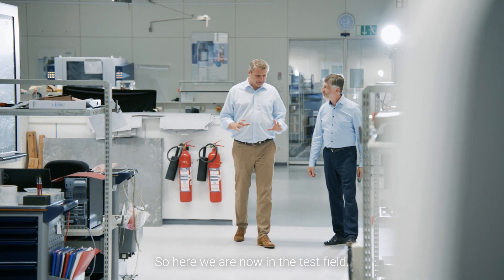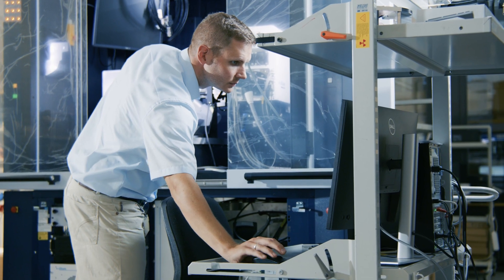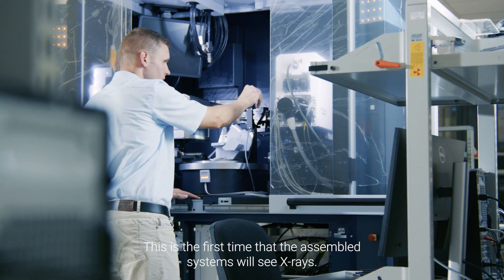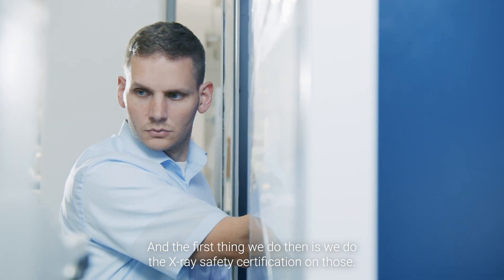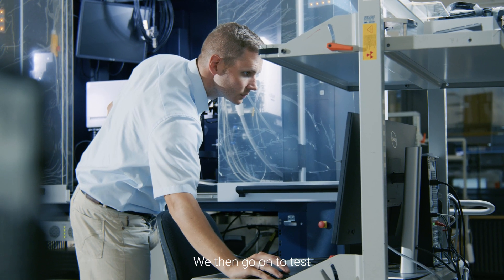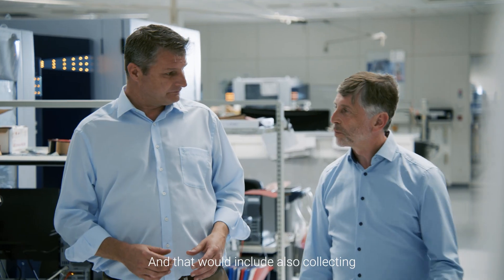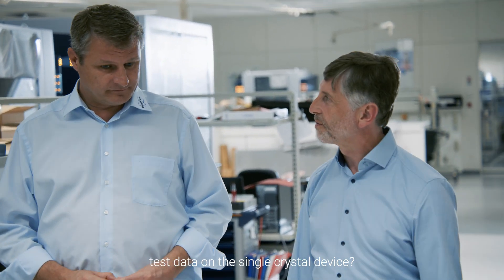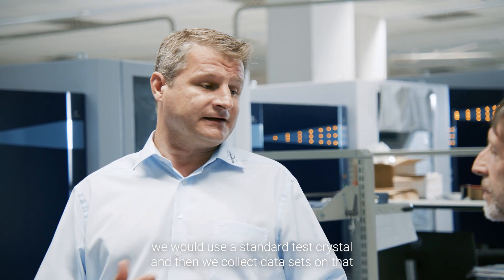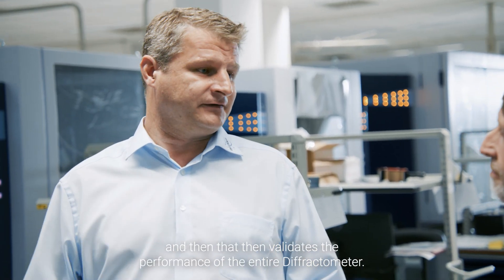Here we are now in the test field, where all the fully assembled systems are tested. This is the first time the assembled systems will see x-rays, and the first thing we do is the x-ray safety certification. We then go on to test the final alignment and the final integration of the system. And that would include also collecting test data on the single crystal device? Yes, on a single crystal device we'd use a standard test crystal, collect data sets, and that validates the performance of the entire diffractometer.